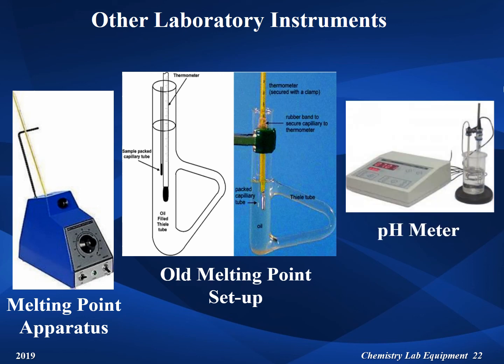The measurement of the hydrogen ion concentration is known as the pH of a solution. The pH is often measured with a digital pH meter, and a special electrode that is immersed in the solution, as shown in this photo. When a pH meter is not available, litmus paper is an inexpensive alternative, which can be used to get a close approximation to the pH of a solution.